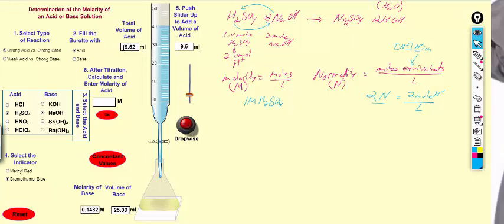All right, well, you can write down 9.52. Again, these values shouldn't change. Then I'll press concordant values again. All right, now this time I'll just go up 8 milliliters. Do it a little bit more carefully this time. I'm going to stop there at 7.5. Now what I can do is just keep hitting the dropwise until one drop makes it change colors.